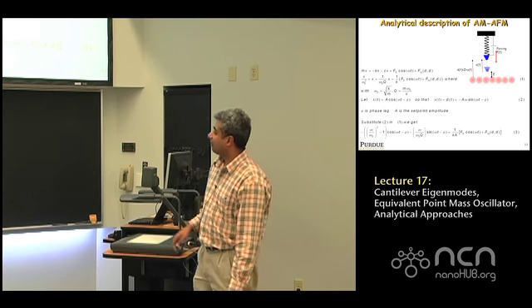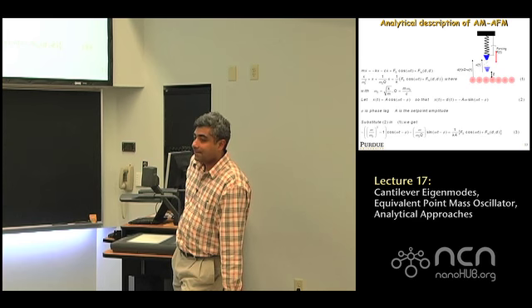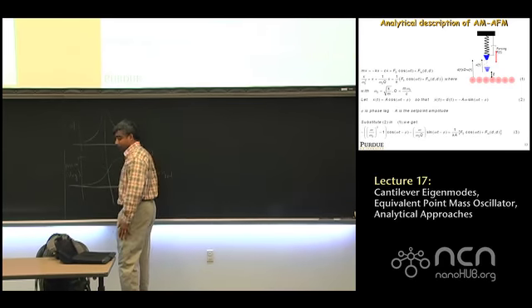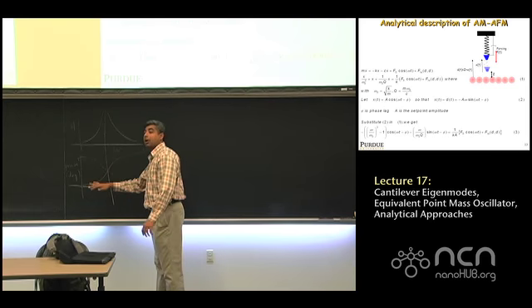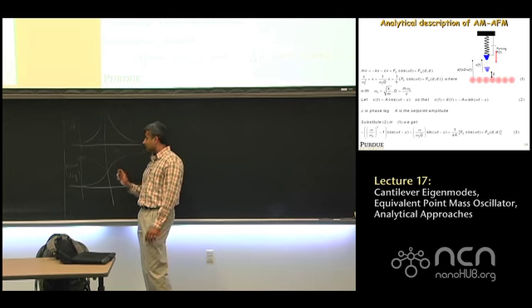So when the AFM company plots the phase in degrees, it can be shifted. Yeah, oh yeah, that's completely true. That's why I did not show any number on here. And so the first thing you do is to look at the generic shape. Does it go down or up across resonance? If it goes up across resonance, it's phase lag. If it goes down, it's phase lead.